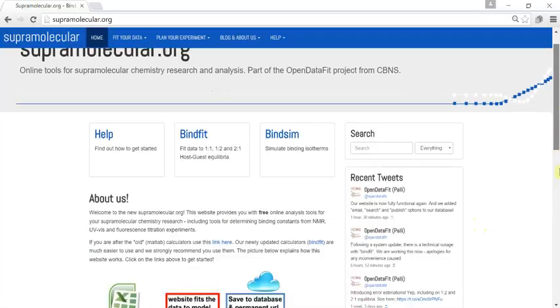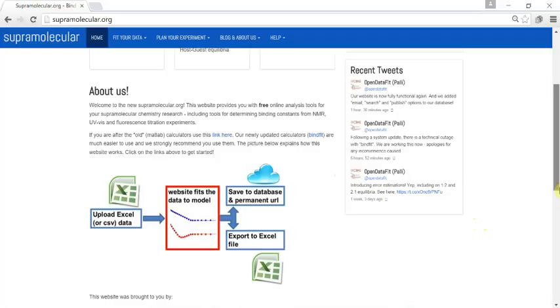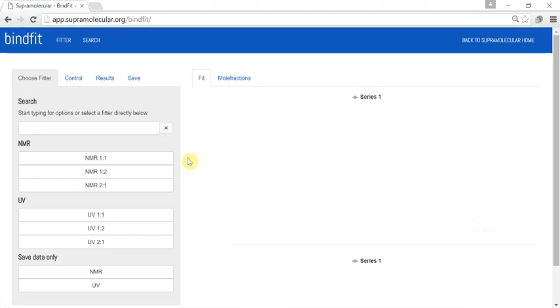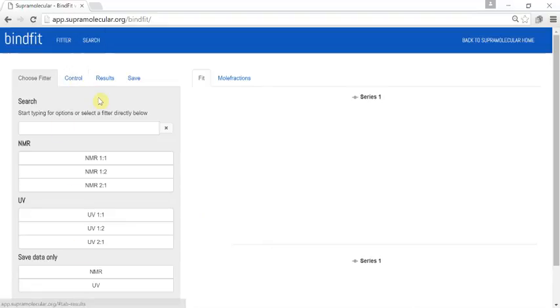Hi and welcome to Supramolecular.org. This website allows you to take your binding data in an Excel format, fit it, and save it to a unique URL or export it to Excel. You start by selecting the binding model that you think is most appropriate to your data.